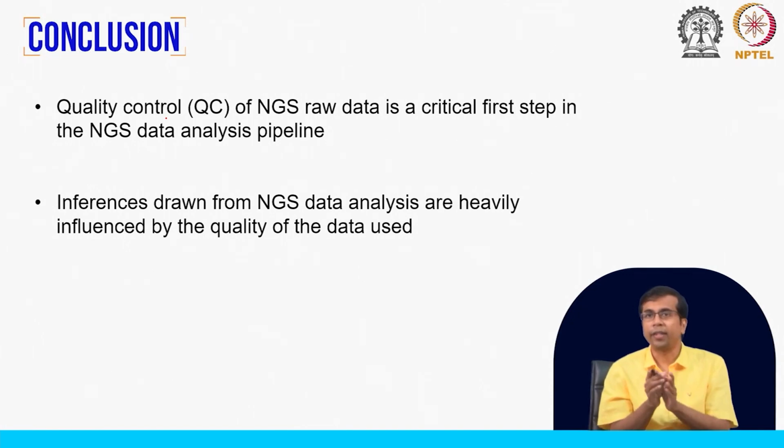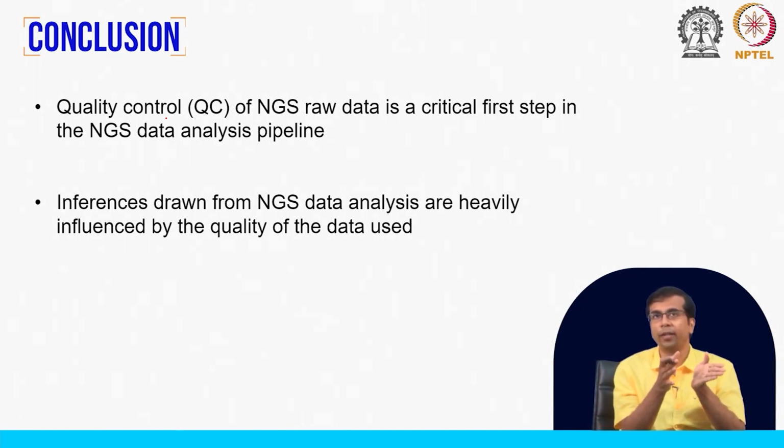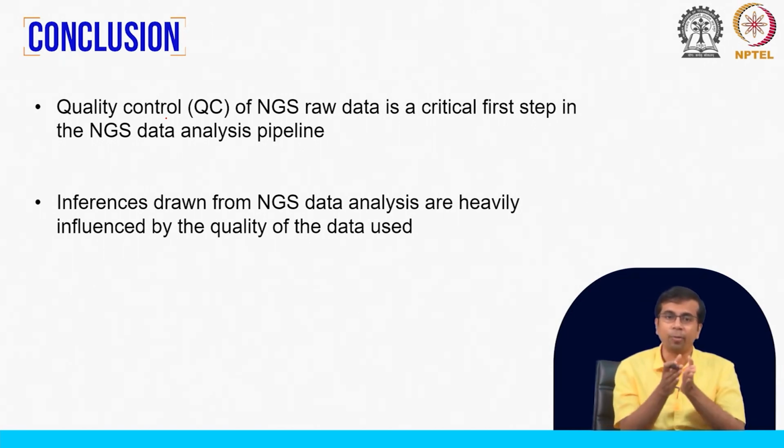Going through the example data, we have seen in some cases the initial part has low quality and also the last part has low quality. We have discussed the reason why we see low quality in the beginning, and this is because the signal detection parameters are being set up there. Towards the end, we have talked about a problem called phasing or pre-phasing.